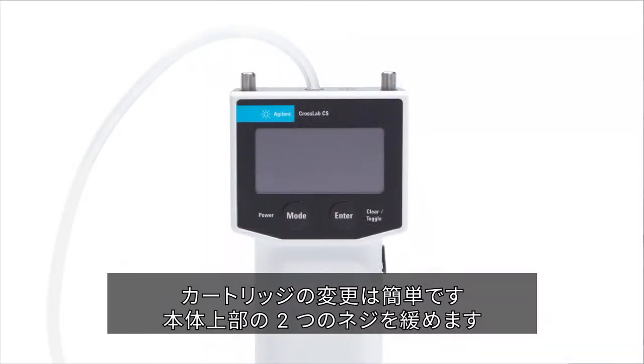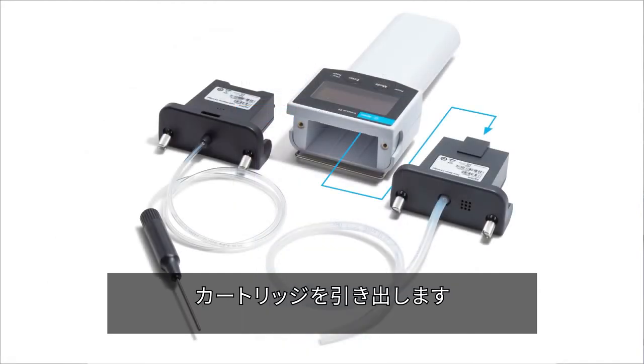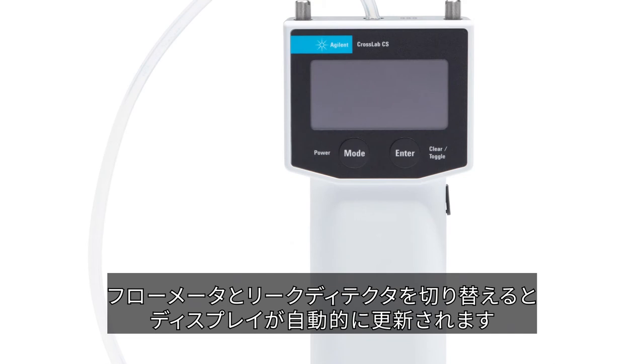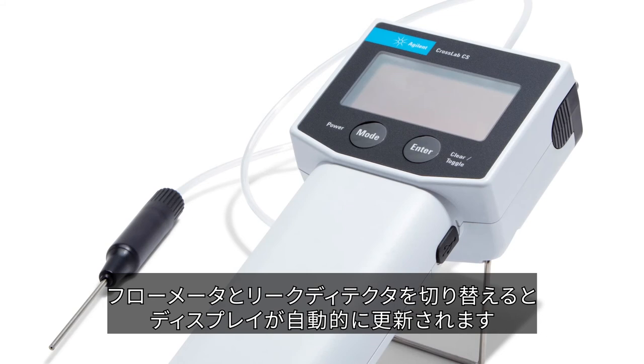To change cartridges, simply unscrew the two thumbscrews at the top of the device, slide out the previous cartridge, insert the new cartridge, and tighten the thumbscrews. The display will automatically update depending on if you are using the flow meter or leak detector.